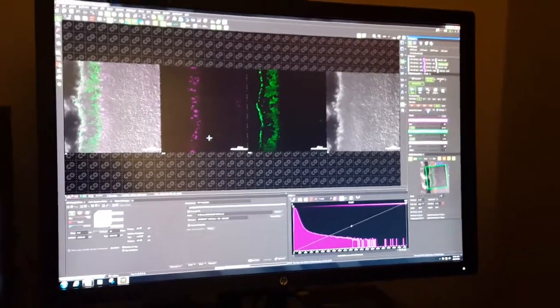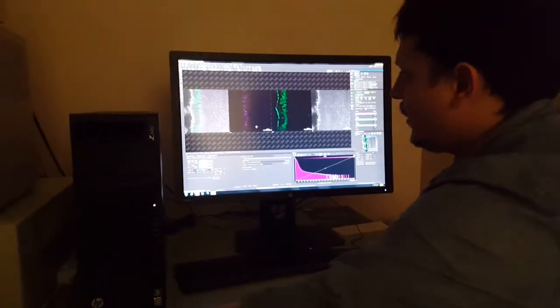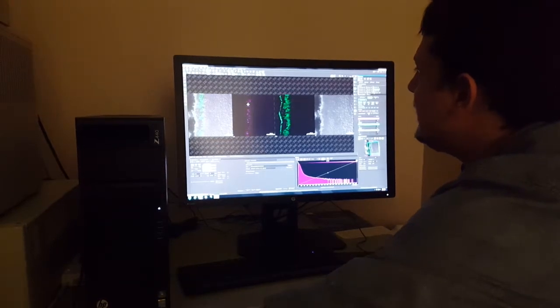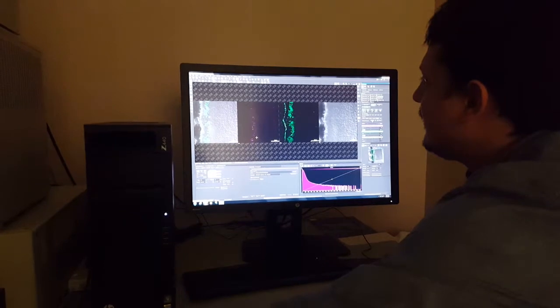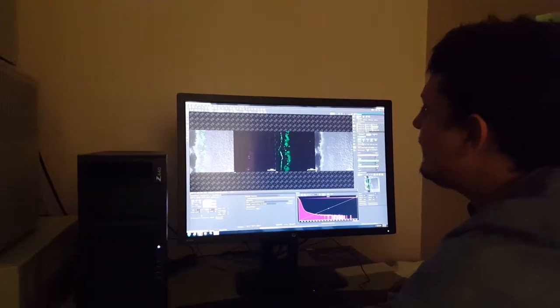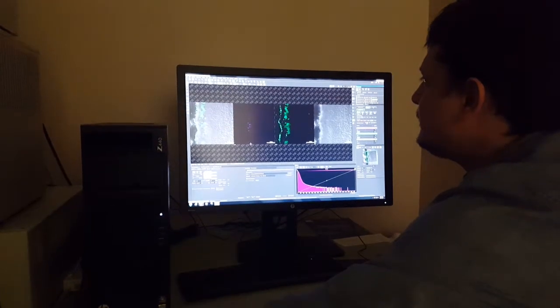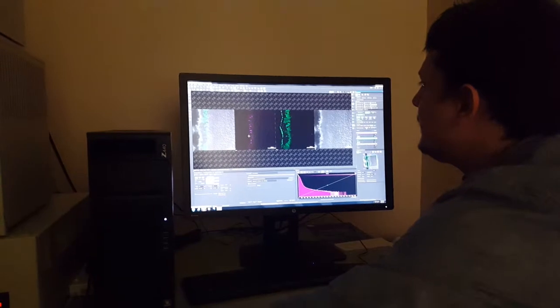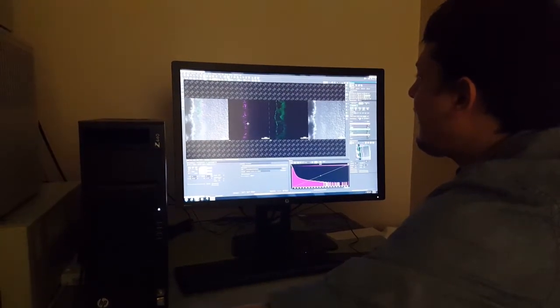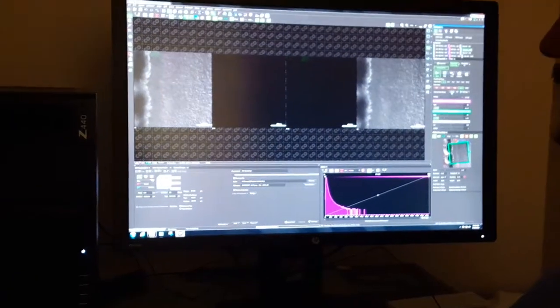So what I'm going to do in this case is set the bottom and set the top for these colors. I'm going to go down, and I see that I'm still having something here, and I'm going to move a little bit down again, setting it as a bottom. I double check if I have something else in the bottom. I don't see much, so I'm going to go up. It's starting to go up, and now we're passing through the middle. Now PNA is disappearing, the green is disappearing. I'm going to set this as a top.